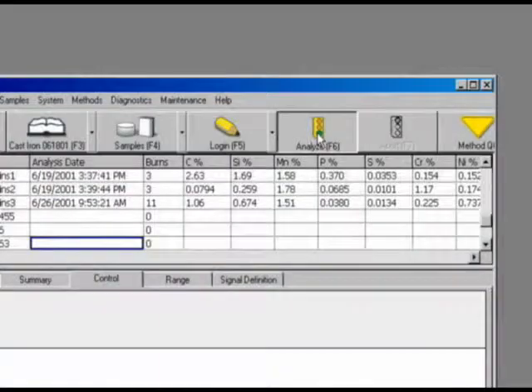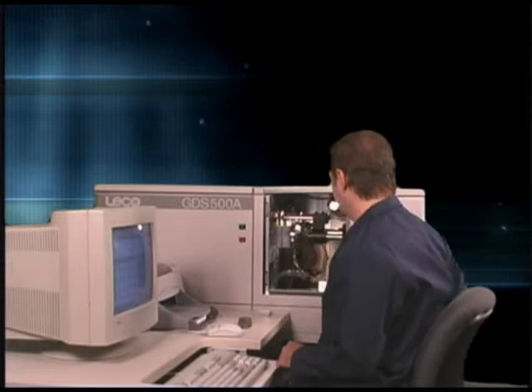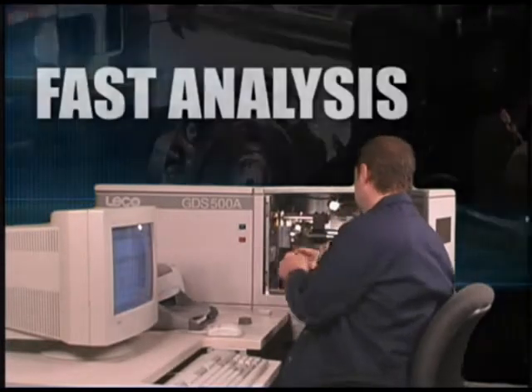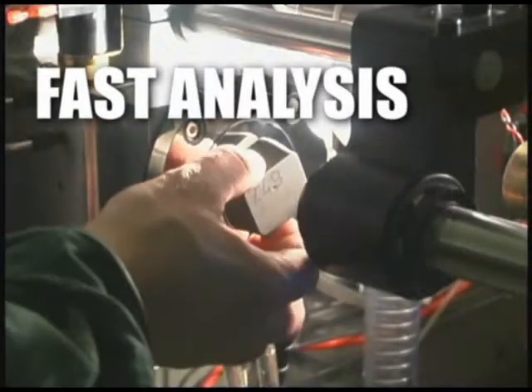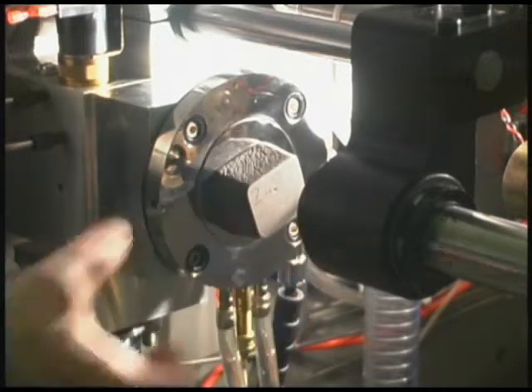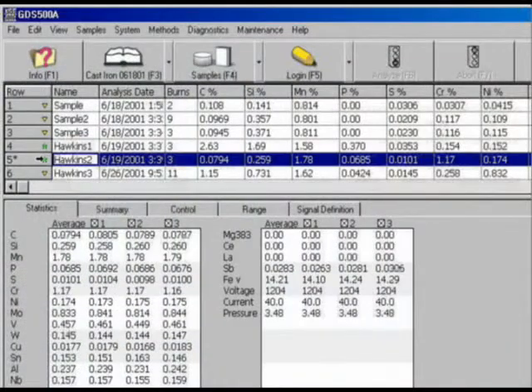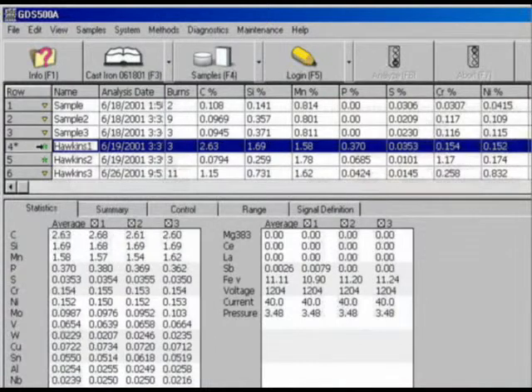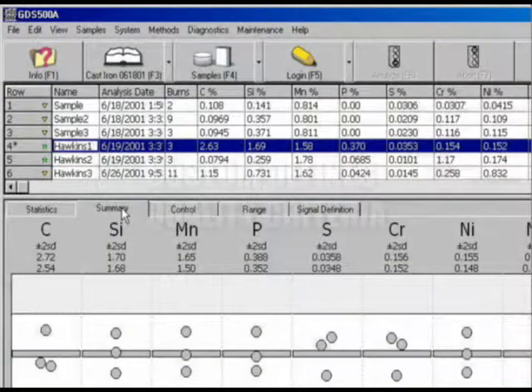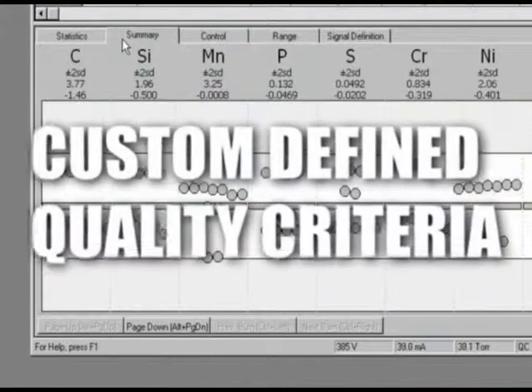To perform an analysis with the GDS500, the operator selects the desired method, loads the sample, and closes the door. The analysis begins automatically. During the analysis, the software displays the analysis status and lamp conditions. The final results are displayed and can be printed and transmitted automatically at the end of the analysis.